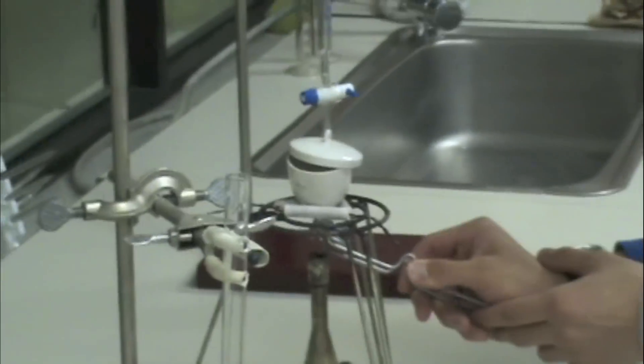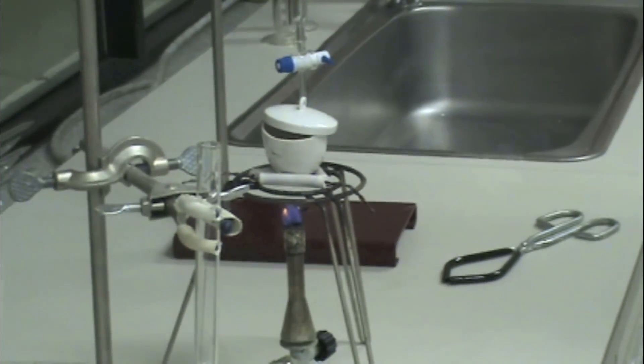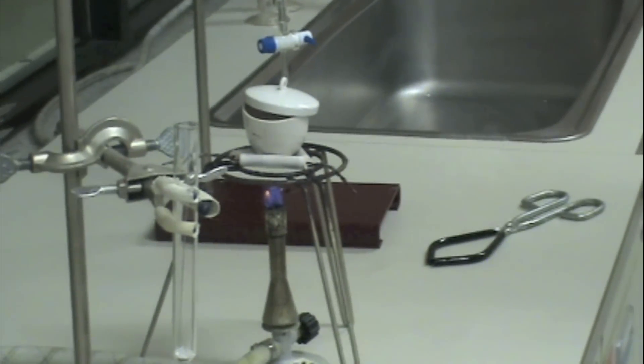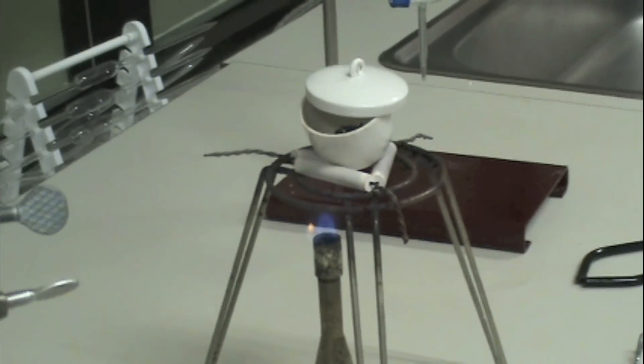Porcelain crucibles naturally absorb some weighable moisture from the air. So if you're planning to make measurements of mass, you need to dry the crucible so that there's only porcelain, no water. And to dry, we need to heat.